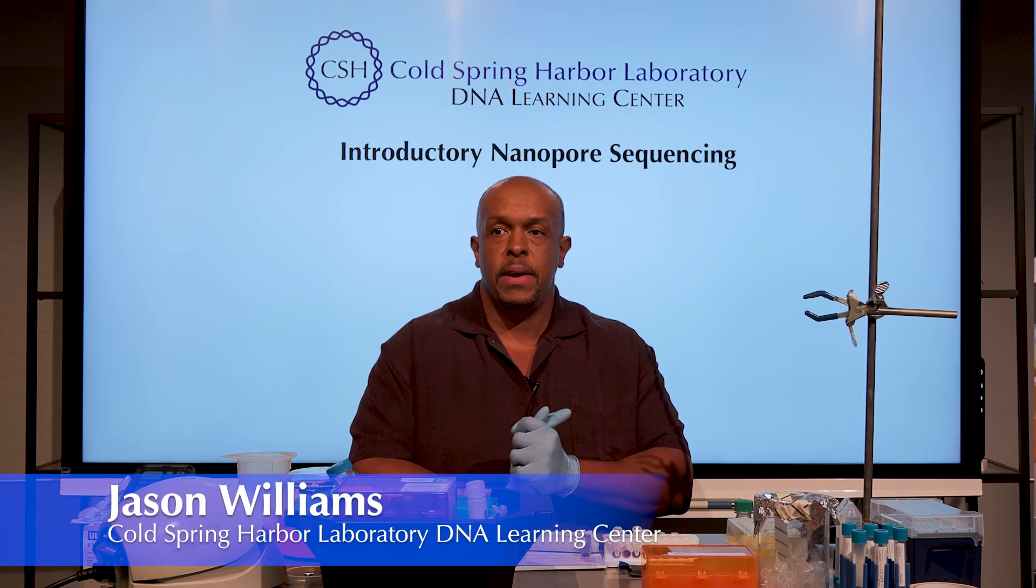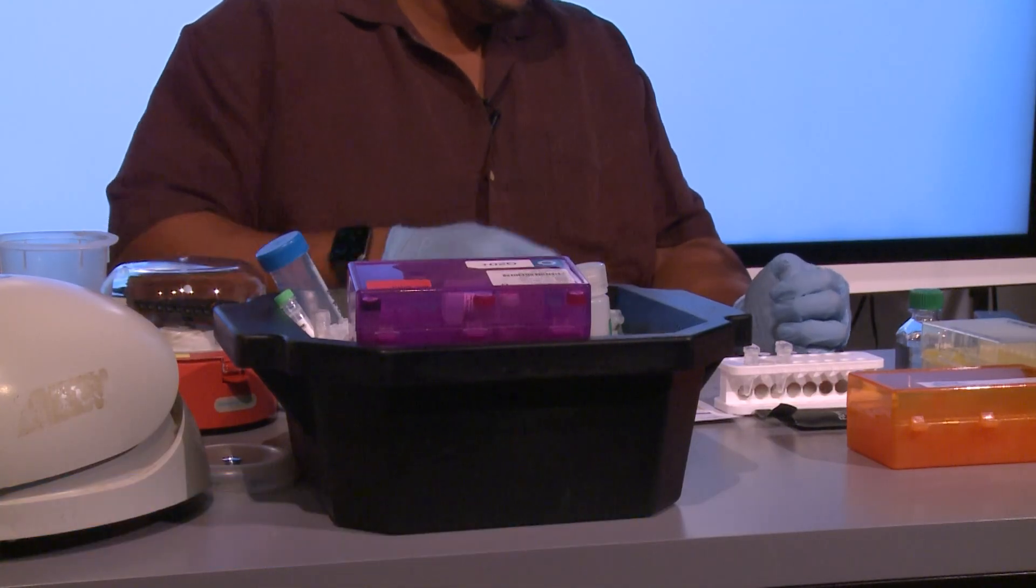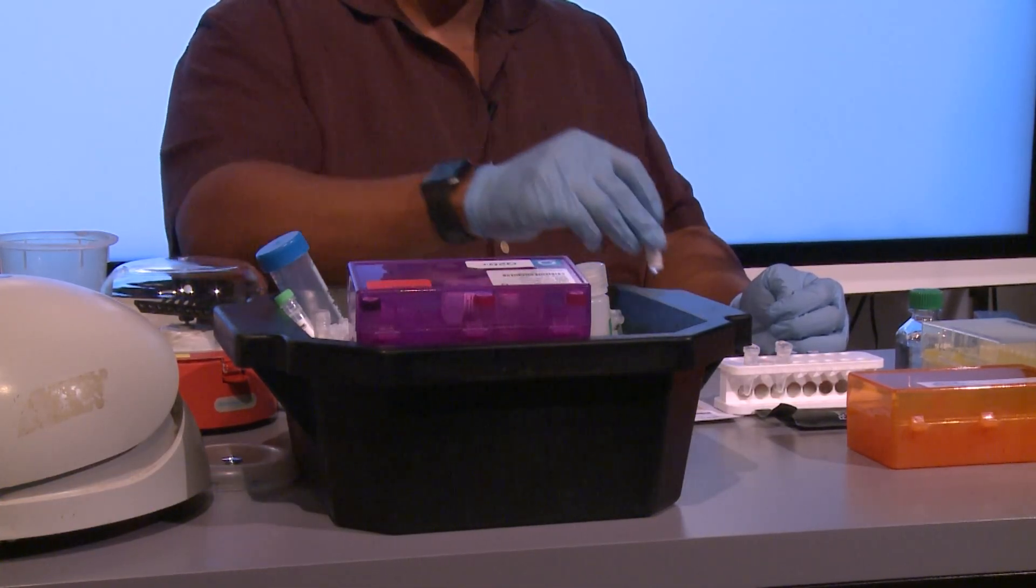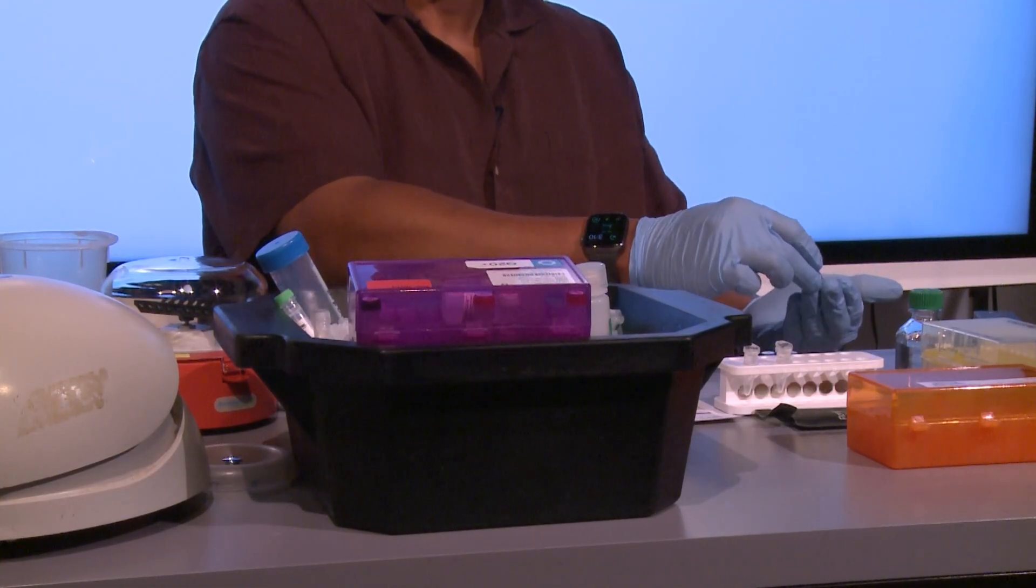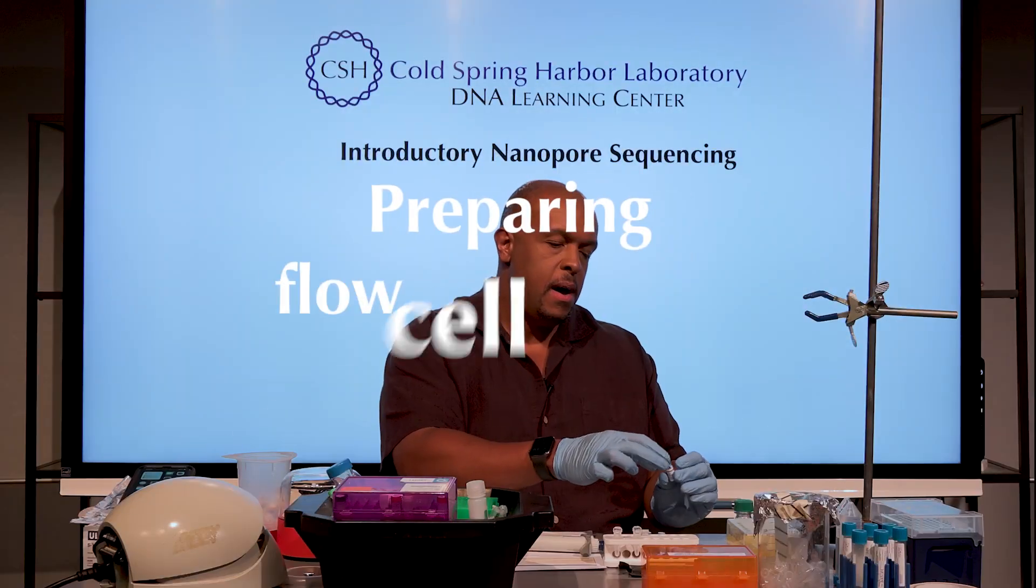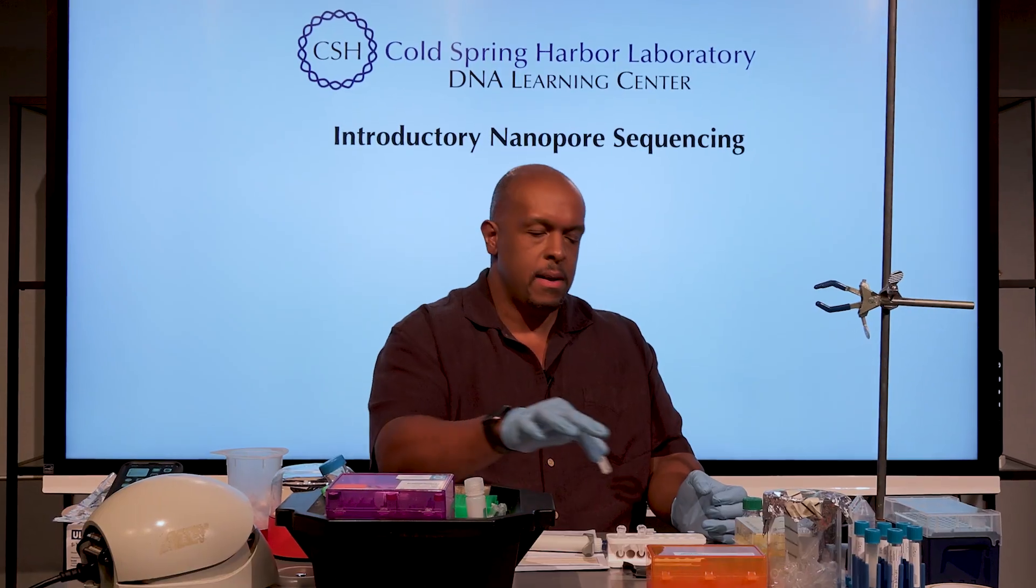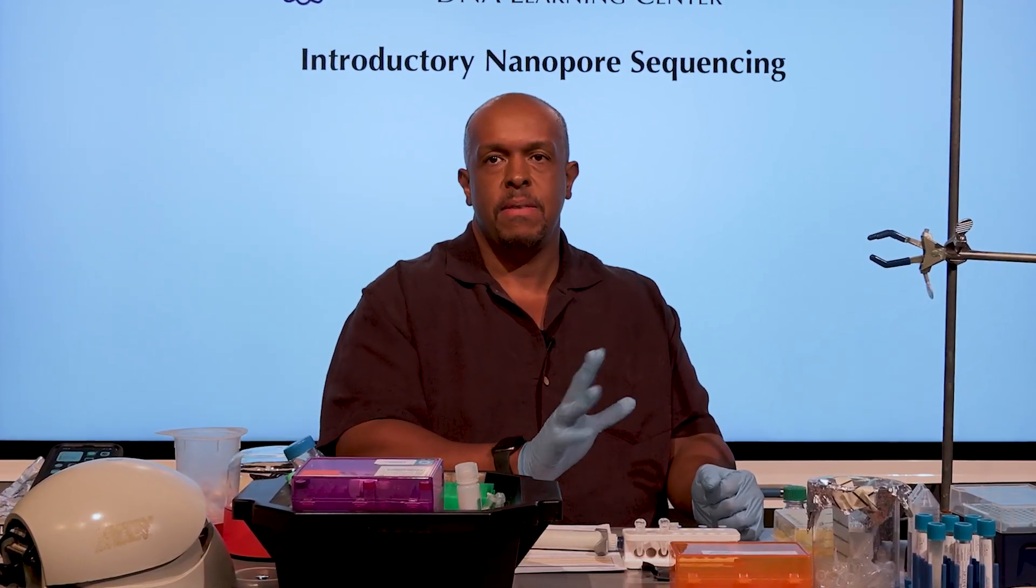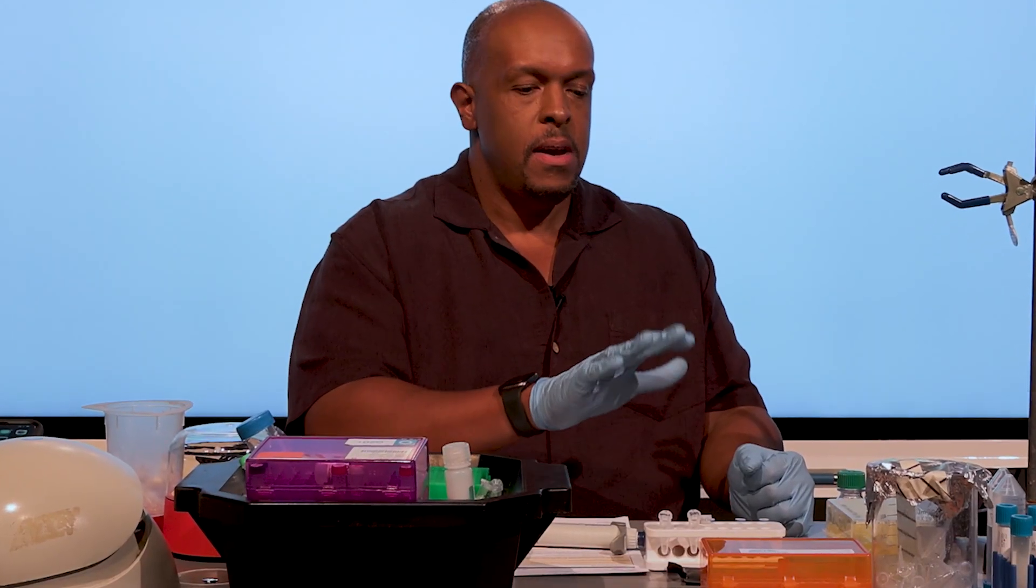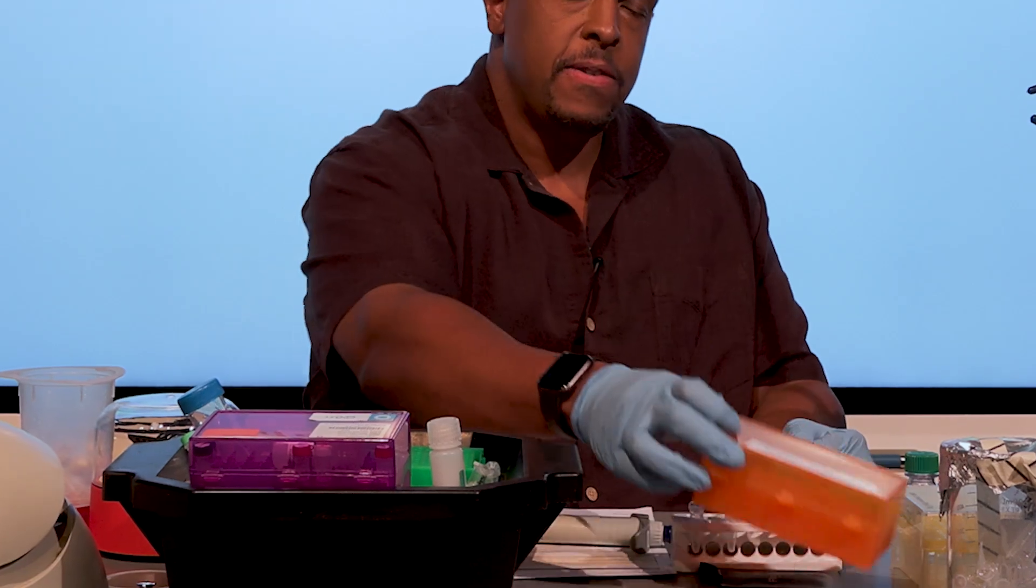Okay, so we are now ready to load the flow cell. One of the key things is that the flow cell comes with its own set of buffers in these glass tubes. They make a comment that these particular glass vials are better for the flow cell—there's something in the plastic ones that might interfere with the sequencing quality.